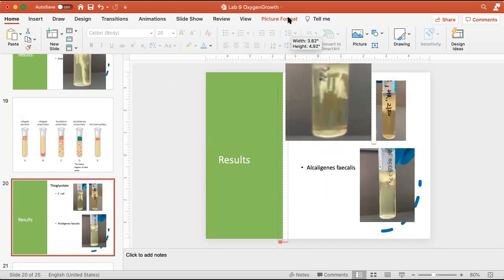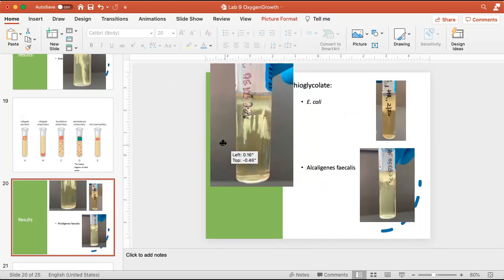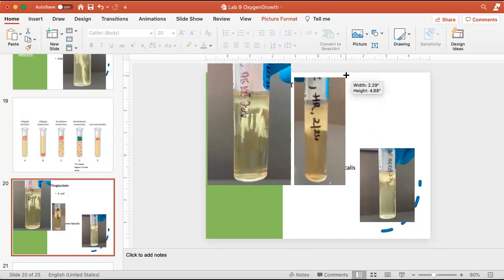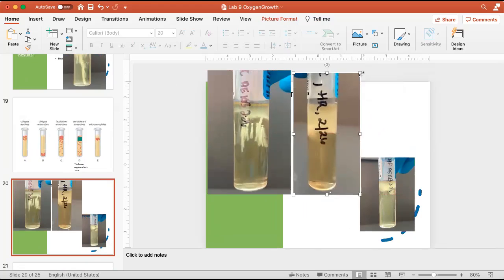And here's our old friend, E. coli. We got a couple of very interesting looking tubes for E. coli, which is why I put a couple pictures in here for you. Look at these tendrils. They're so bizarre. They look like they're hanging in the middle of nowhere. There's agar in here, which is why they're able to be suspended like this. Very, very strange. Over here, you can also see a big clump here, and there is a tendril right here. If you're seeing a sort of an opaque line, there is a tendril right here.